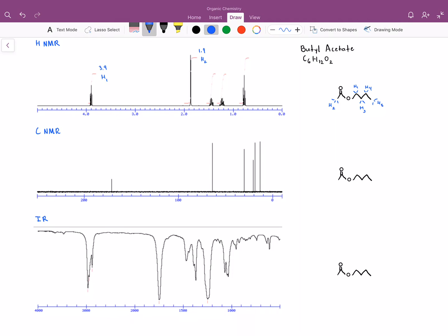The next two peaks at about 1.5 and 1.3 are the hydrogens labeled H3 and H4. This final peak cluster corresponds to the hydrogens of H5 showing up at about 0.8. As we move further away from the ester group, the electron withdrawing power of oxygen within the ester group and the resonance present within an ester group diminish, so our hydrogens will be more shielded and have more electron density. We see that pattern moving down the carbon chain of our compound.